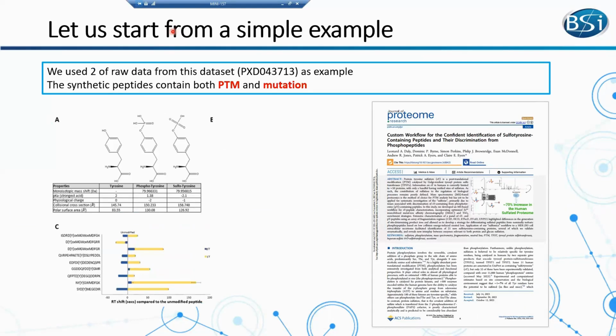Then we can start from a very simple example to show our new workflow. The data set is from this paper, which used PEAKS to investigate two very close PTMs, phosphorylation and sulfation. At first, they synthesized some peptides, so we know the peptide sequence, the PTM type and the PTM position. They also synthesized some mutated peptides, and we know the mutation position and what mutation happened in this sequence. So it's a very simple sample.